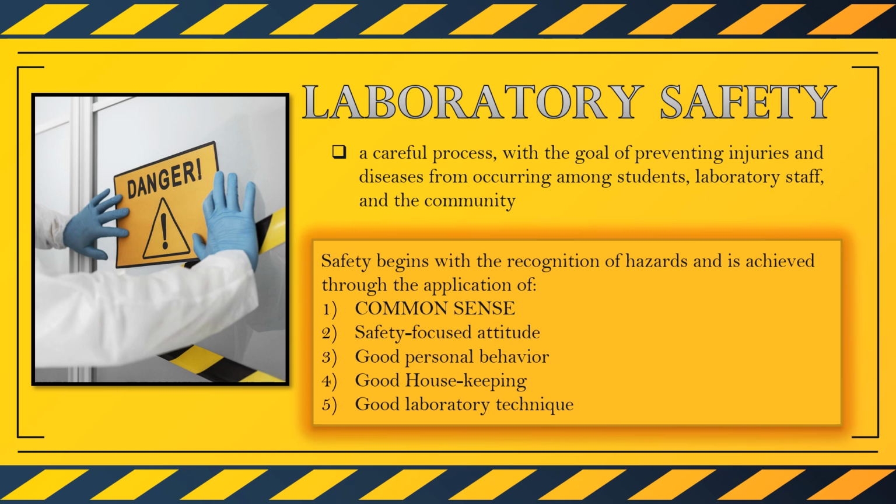Common sense dictates that protective equipments should be worn at all times for protection against reagent spills and other laboratory hazards. So what else? Keeping the work area clean. Common sense dictates that a clean and organized working area will prevent accidents and make it a lot easier to identify and correct any potential hazards. So, everything, including a safety-focused attitude, good personal behavior, good housekeeping, which I have already mentioned earlier, and good laboratory technique, are all intertwined under the application of common sense.